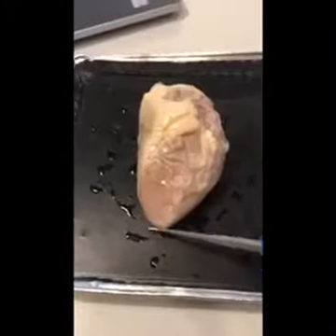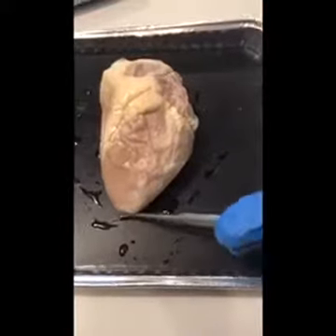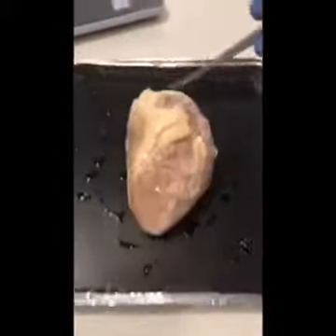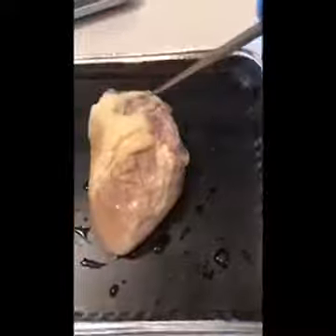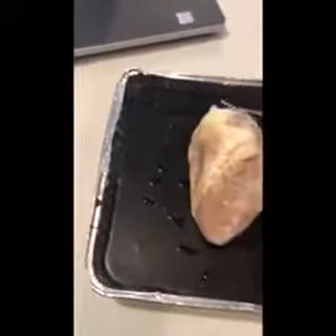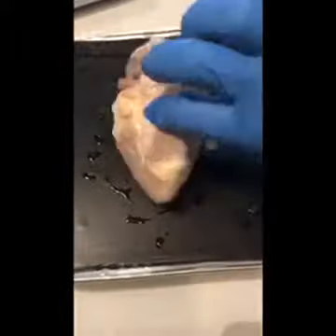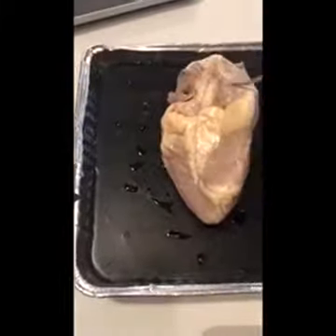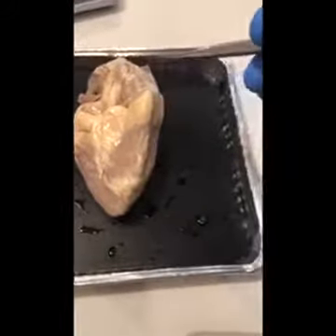Okay, so this pointed inferior end of the heart is the apex, which is at the end of the left ventricle. Up here on the opposite end, the superior end, would be the base, which is formed by the right and left atria. This side will be our anterior side, and if we flip it over here, this will be the posterior side of the heart. These two little things over here are the auricles, which are pouch-like extensions on the atria.